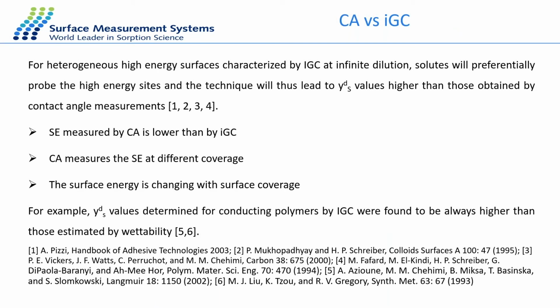There are also several publications which highlight that for heterogeneous high energy surfaces characterized by IGC at infinite dilution, the solute will preferentially probe the high energy sites, and the technique will lead to surface energy values higher than those obtained by contact angle measurement.